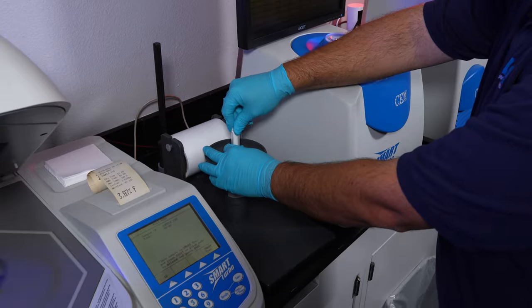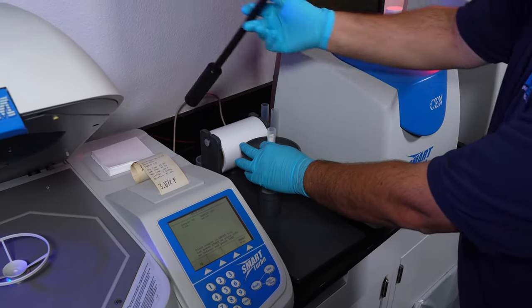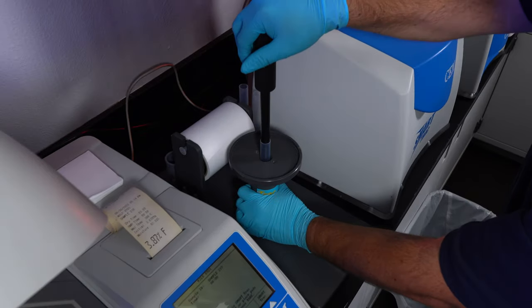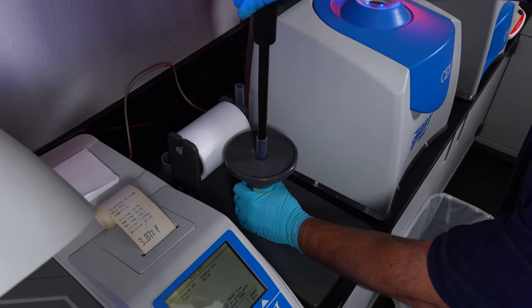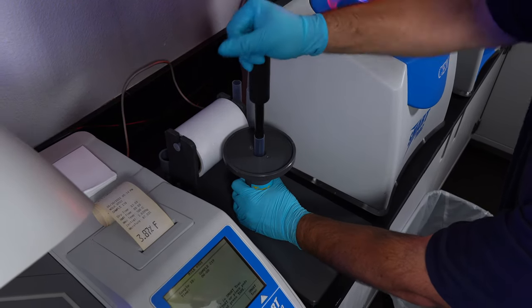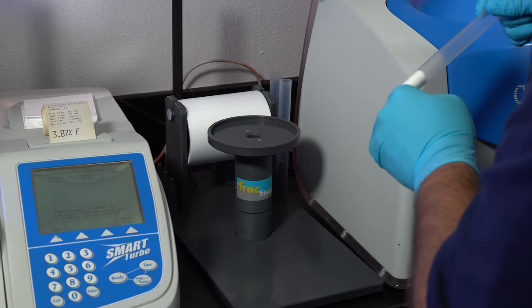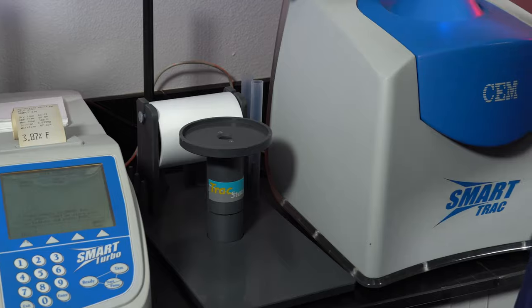Once the film is folded, place it into the tube. Place the tube into the SmartTrack Station. Take the rod and use it to compress the rolled up sample, ensuring the entire sample will be read during the fat analysis.